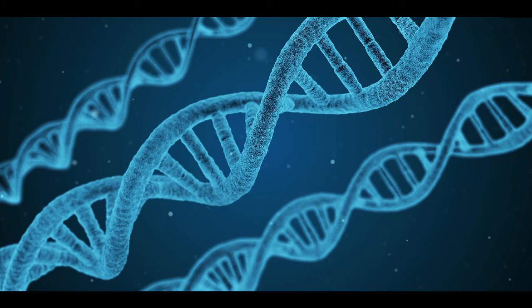And there's really no other region that's quite as good at doing that. There are other important regions that you can look at in terms of comparing fungi, but ITS is just a brilliant region. And frankly, for most fungi, you'd be wasting your money if you did full genome sequencing, because a lot of the information would be absolutely useless. You would get the whole phone book when you really just want one page of the phone book. So that's the long answer.